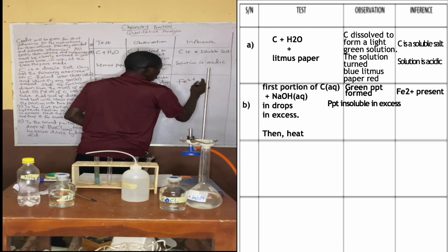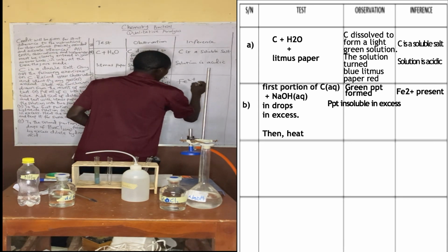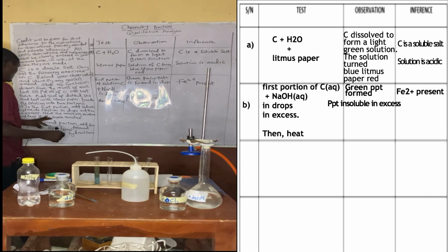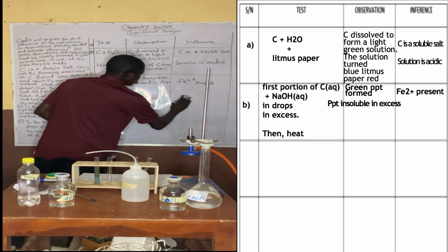Fe2+ is present here. You can say Fe2+ is present, Fe2+ confirmed.